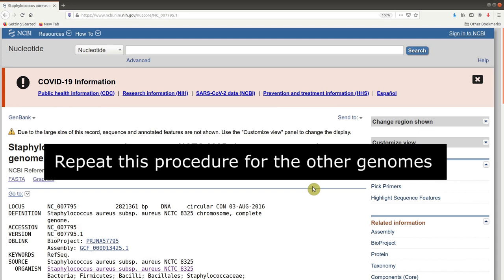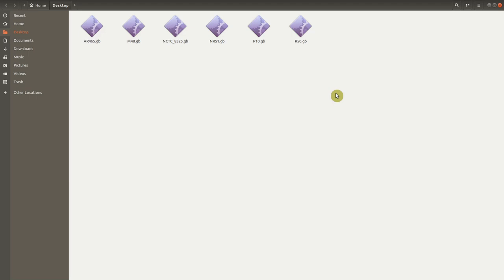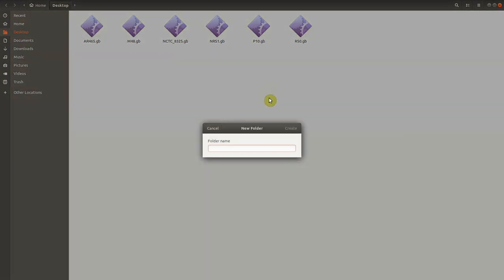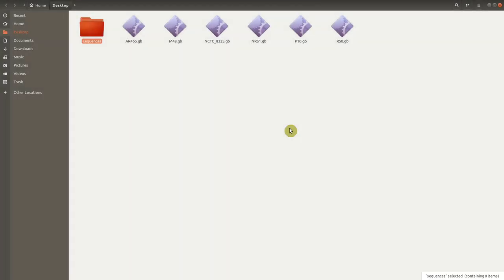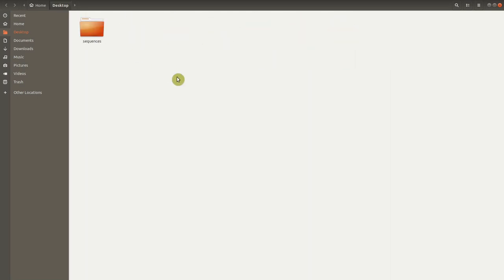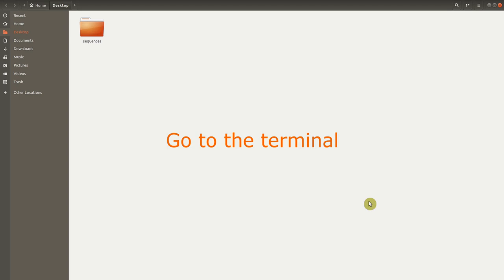After that, we download the remaining five strains using the same procedure. After all six are downloaded, these are my GenBank files — we are supposed to have six of them, so please check. I would like to organize my files a bit better, so I will place all of them in another directory. I will create a new directory called 'Sequences' and place the files in it. Now let's go to the terminal and continue the rest from there.